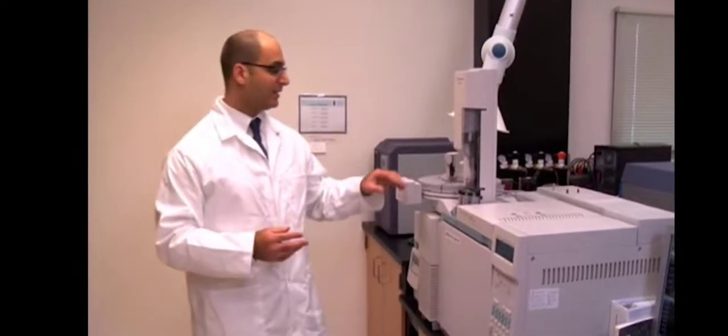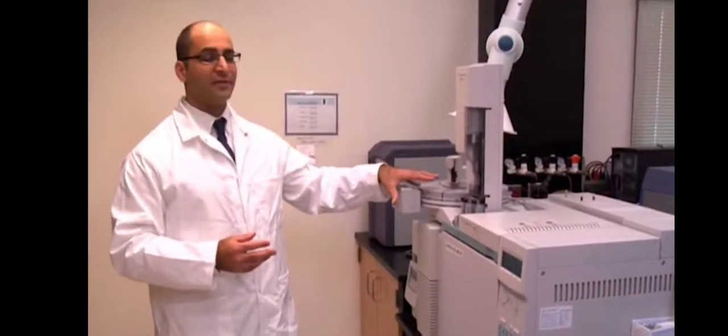Once the solvent extraction is performed and the compounds are placed into solution, we can then put them onto our gas chromatograph mass spectrometer. What we're primarily looking for in this laboratory are ignitable liquids and their residues. And most of the things that we're looking for are very complex organic mixtures. And this instrument is very powerful at separating out those organic mixtures.